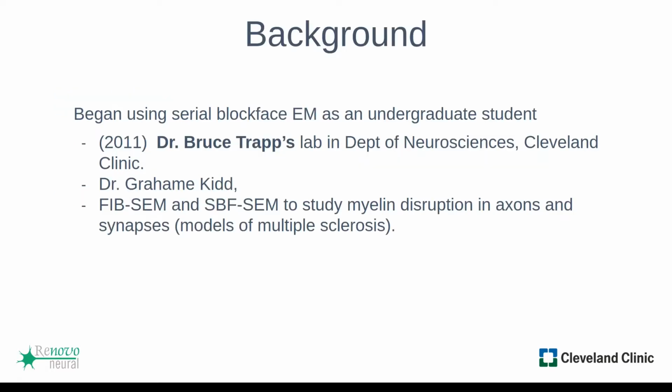So both Renovo Neural and the Cleveland Clinic have had long involvement using serial block-face EM in academic neurosciences and other specialties, and also commercial preclinical testing. This technology has proven extremely useful in both academic studies and preclinical pharma projects. I personally began using serial block-face EM as an undergrad. It was mostly just a case of being in the right place at the right time.